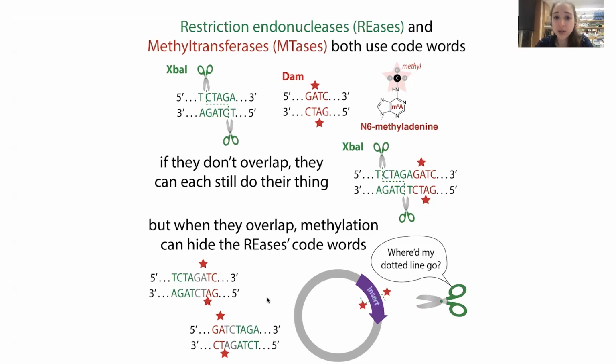And so this is good for when the bacteria don't want to cut themselves, but it's bad for when we want to cut them. I'll talk more about some uses where you need to be careful. You'll see things on the protocols, in the restrictions for the enzymes, that tell you about their compatibility. And then there are bacteria strains that you could use that potentially would not have that methyltransferase. But why do we want this methyltransferase?